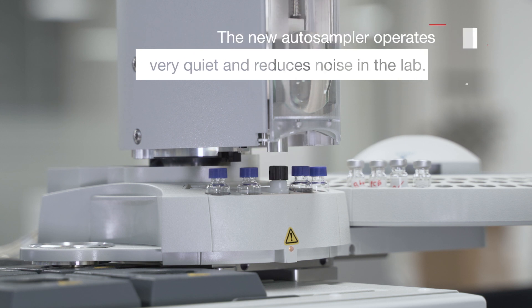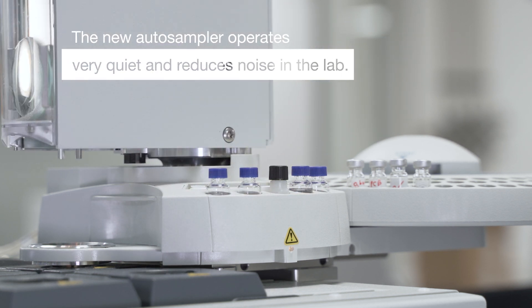Another nice thing is that with this new GC also comes a new auto sampler. There are two big improvements in this new auto sampler, and one of them is that it's a lot quieter than its previous auto sampler. In some labs it's very nice that a machine does not make a lot of irritating noises, especially when you work closely to the instrument.